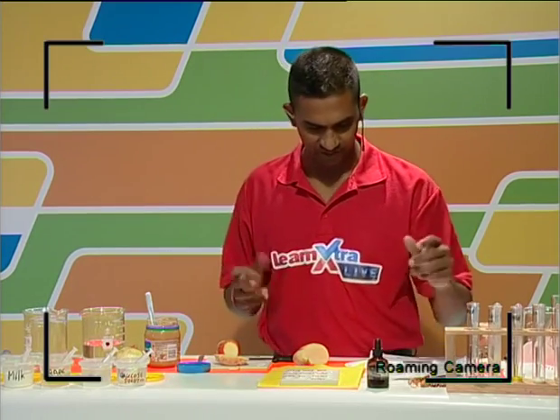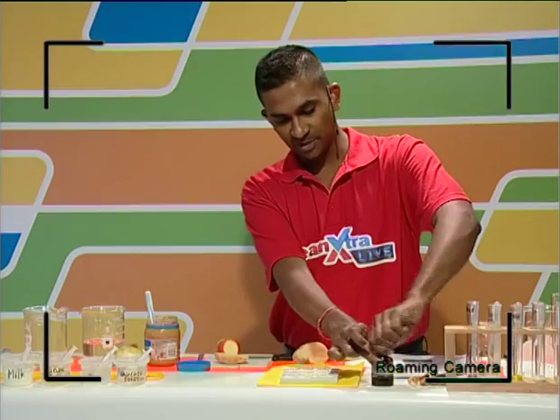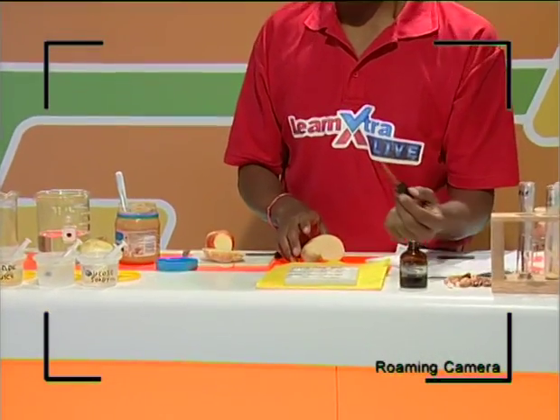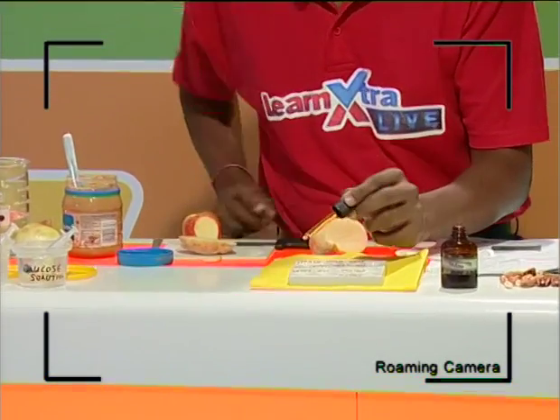So that's what we've got. I'm going to very quickly put a few drops of iodine into this, and I actually want to show you. We know that potatoes contain starch, but we've got to try it out in our positive control.